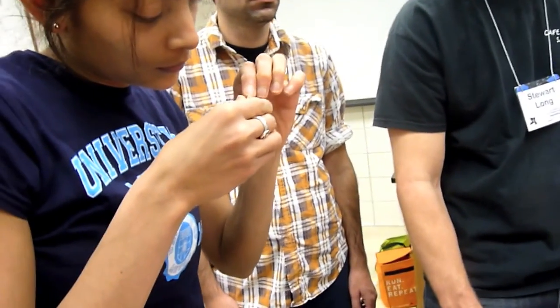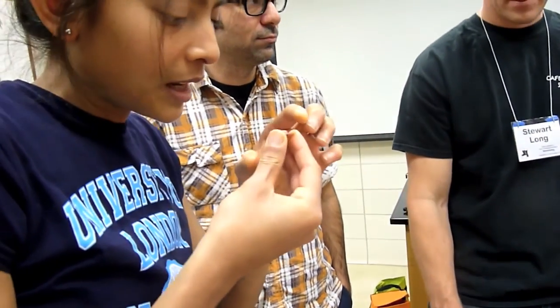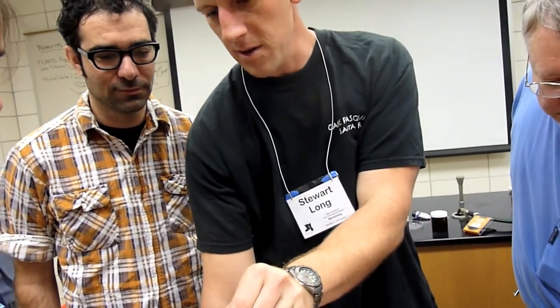You turn the bulb on once and see where your spectrometer is seeing mercury, and in the software you specify that band, and the software remembers. As long as you use the same number every time, it's the same thing. Compare this with what you have in calibration.